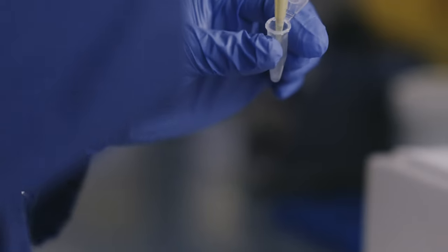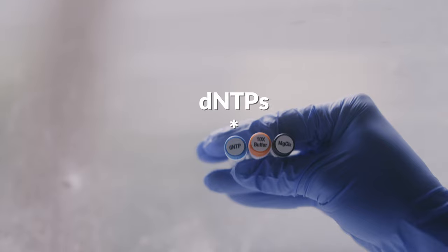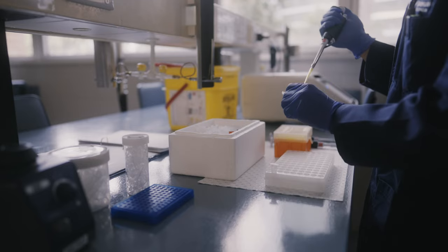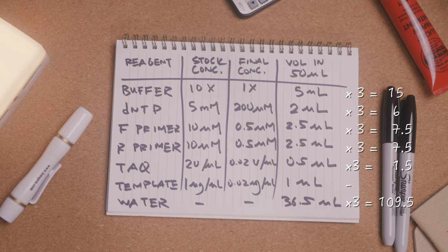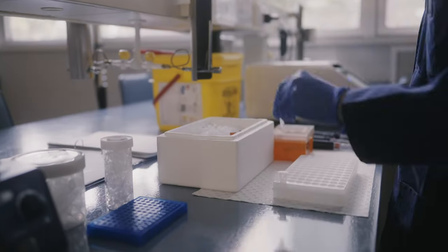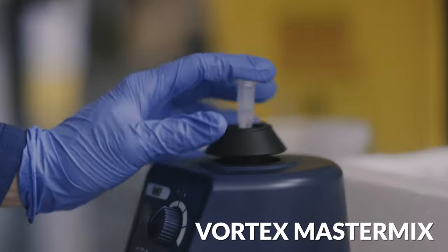Let's prepare the master mix by first adding the enzyme buffer, then the dNTPs. Note we're working on ice as much as possible, especially when it comes to the stock reagents that need to be reused. Pipette both the forward and reverse primers into the master mix. Add the right amount of sterile water to make up to the final reaction volume of 50 microliters in every tube for this experiment. We then add the Taq polymerase and vortex the master mix solution. It's now ready to go.